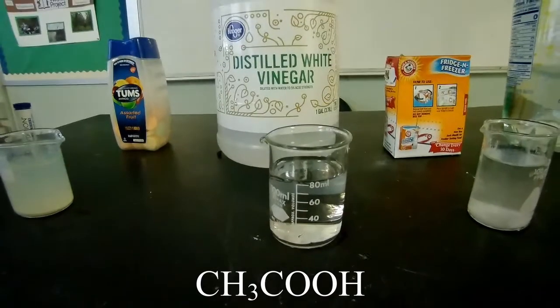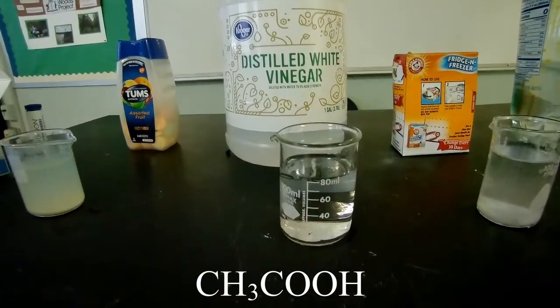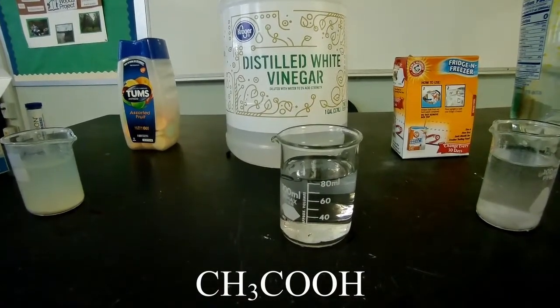So let's take a moment, make our prediction. Do you think it's an acid, a base? And let's describe it.